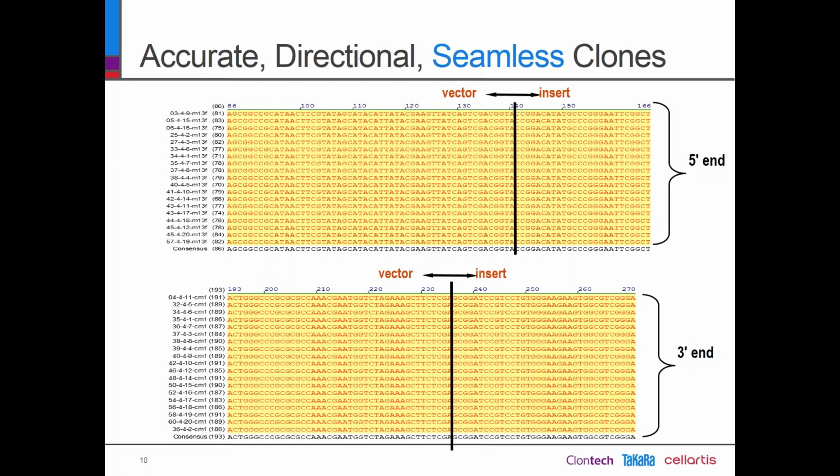So as these sequence reads show, you can look at all the bases, but I assure you that they are all correct. So they show that, first of all, the PCR enzyme that you have used is a very high fidelity enzyme. There are no errors in the PCR fragment itself.